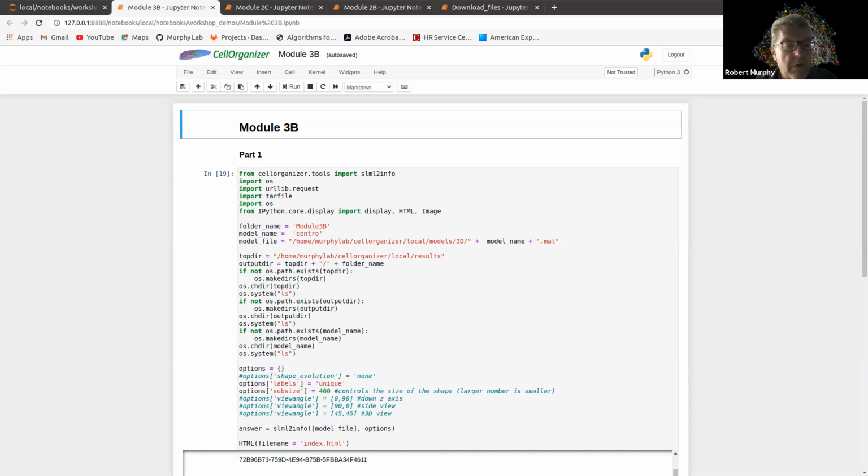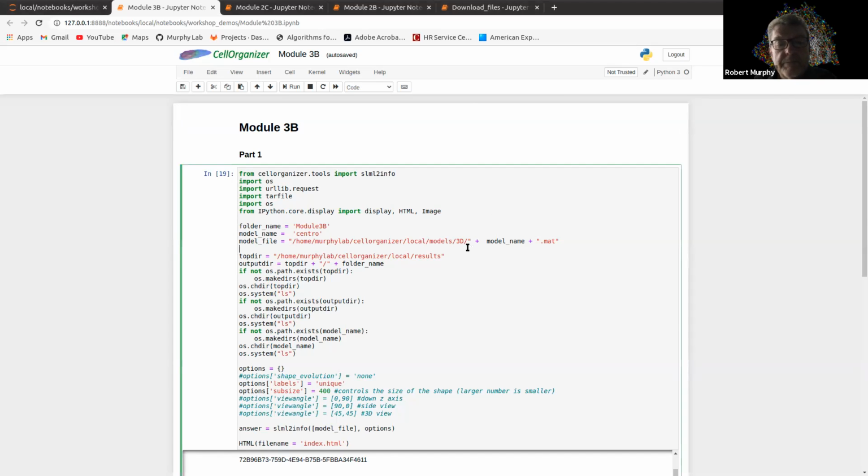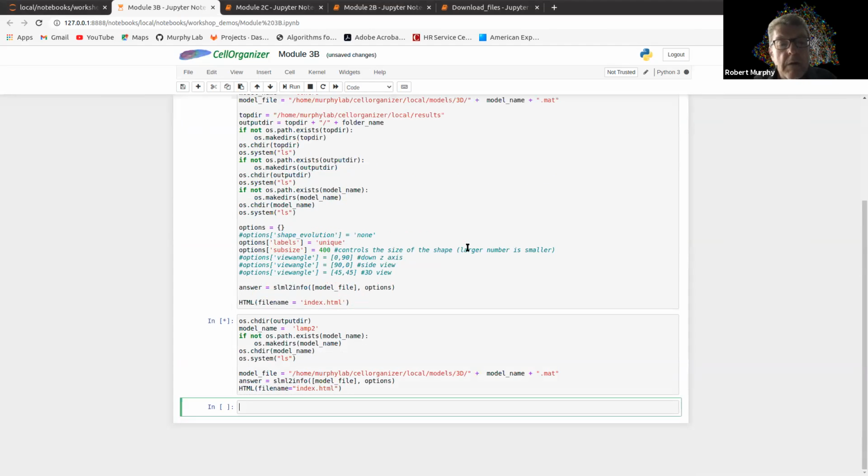So where were we, Ted? So back to module 3, it is about protein models. Okay. And so let's go ahead and run that one, Ted.